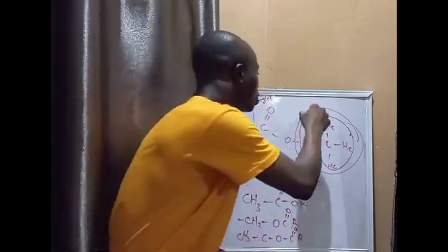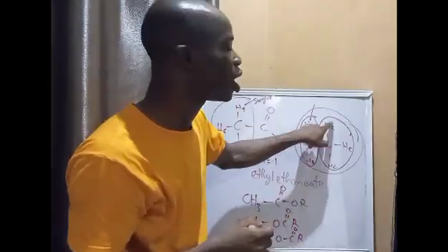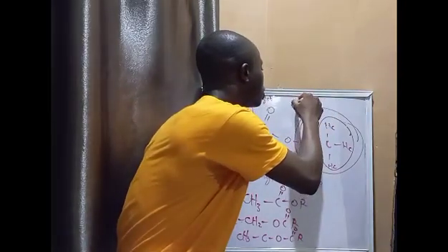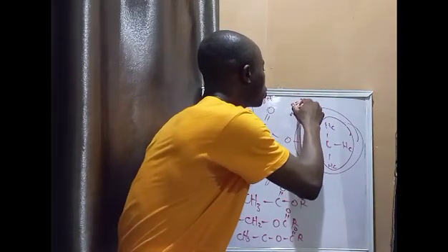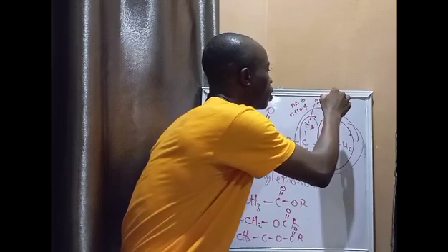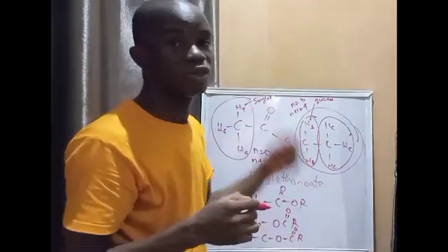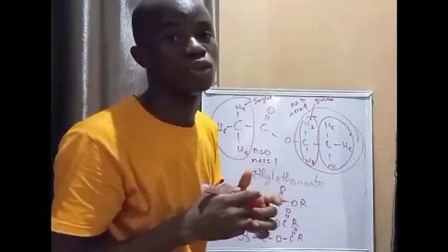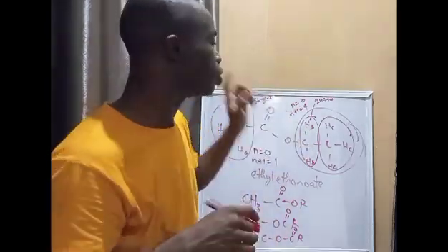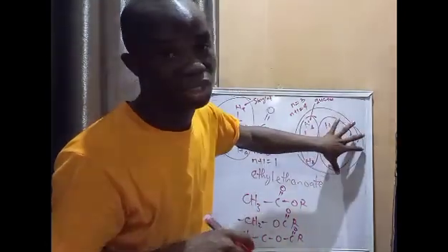But for this one that we have here, the adjacent carbon to this carbon carrying the two of them has 3 protons. So that means our n in this case will be equal to 3, and n plus 1 will be equal to 4. So that means this will be a quartet. So the multiplicity of these two Hb will be a quartet, even though they are coming out as a single signal. So the single signal for these two Hb will be a quartet because the adjacent carbon to the carbon carrying the two of them has 3 hydrogens.